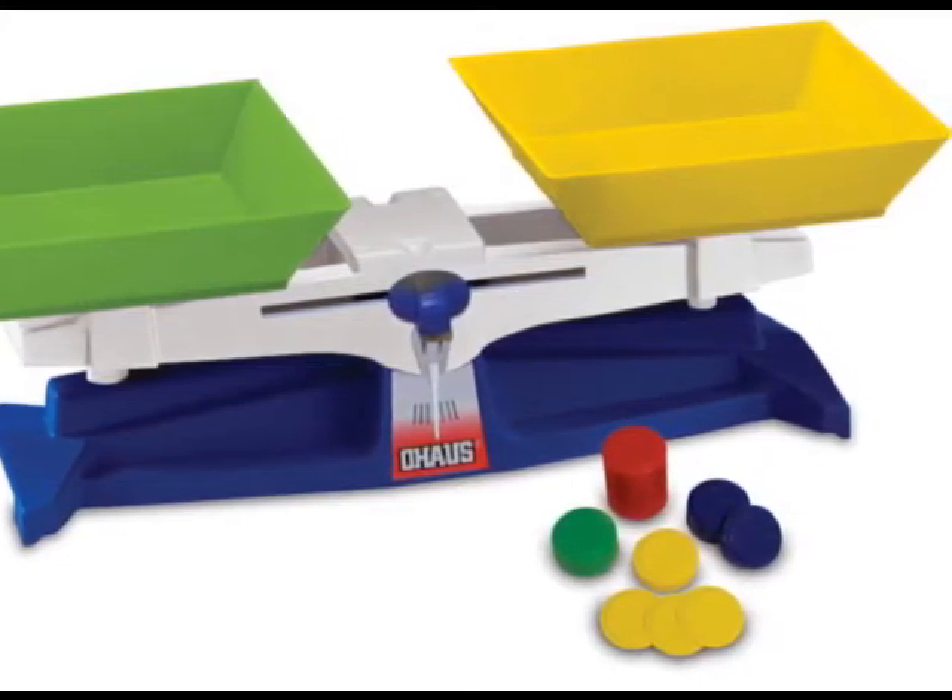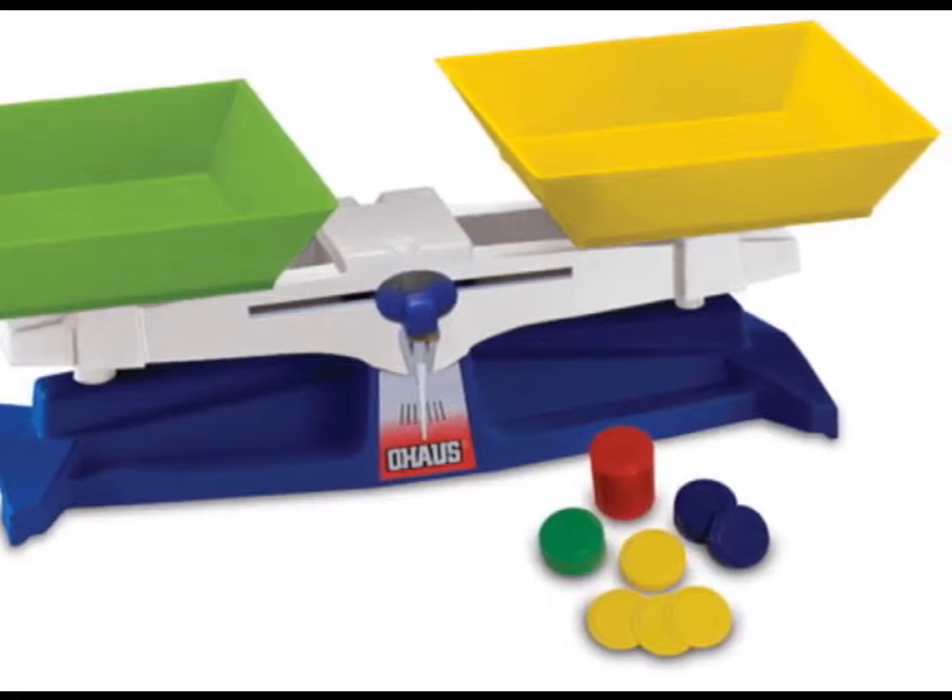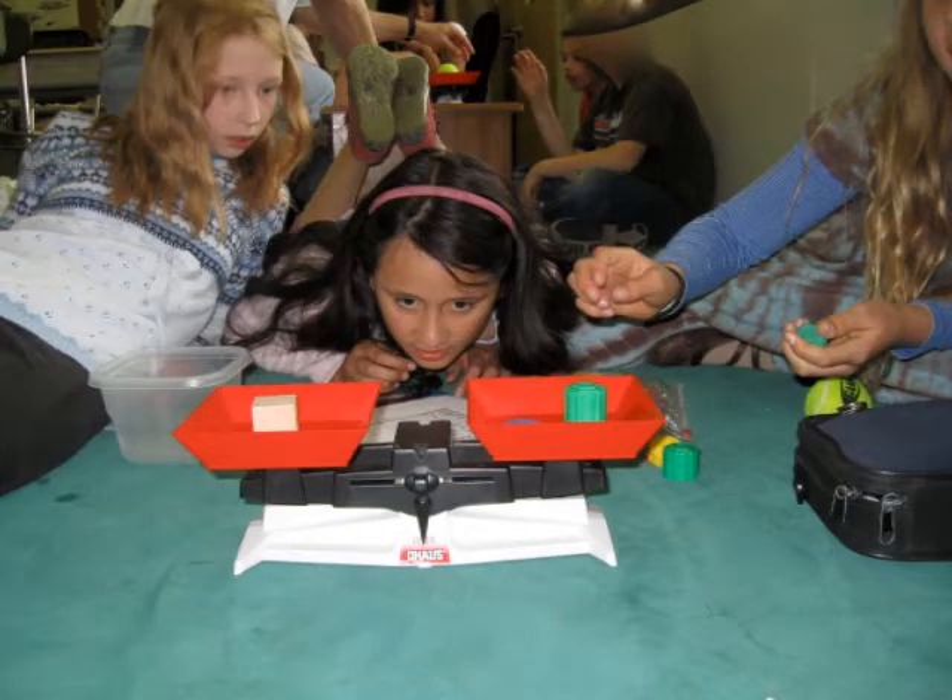Next, you need to make sure the scale is clean. Make sure there's nothing inside or on the scales or the scale buckets that will change the data in any way. Another thing you want to make sure you do is to place the items that will be weighed carefully into the scale. If you drop something heavy onto a scale, it will change the data — it might go down a lot quicker and you'll have to wait for it to balance out.